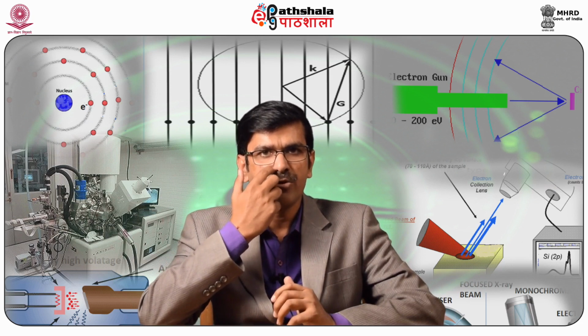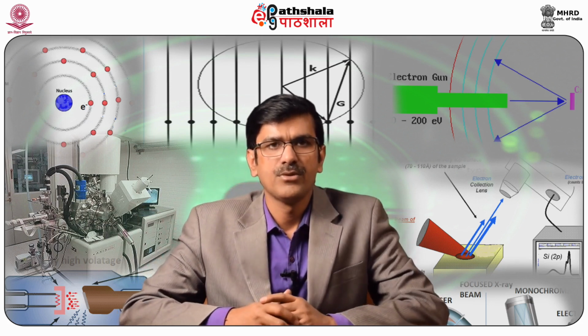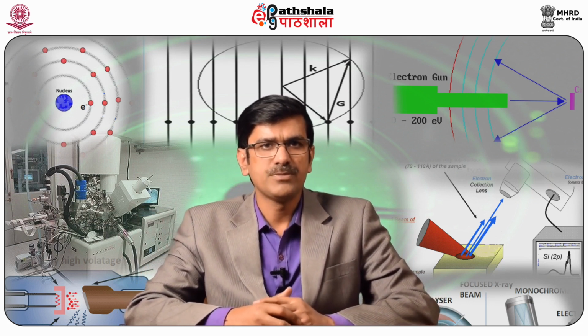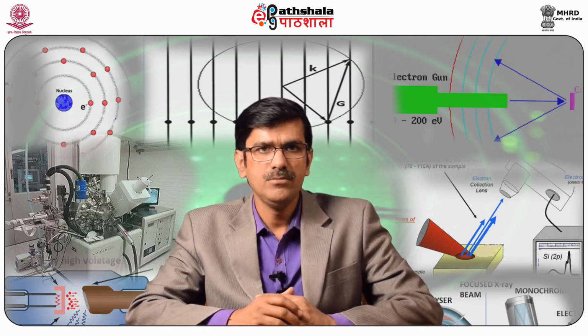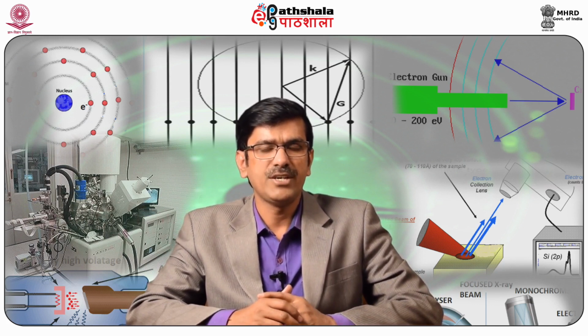Why is a synchrotron X-ray source more attractive than a conventional X-ray source? It is an important question, and here is the answer. There are two main features that make synchrotron XPS very attractive as compared to conventional X-ray sources: A, the extremely high brightness of the excitation, and B, the tunable photon energy.